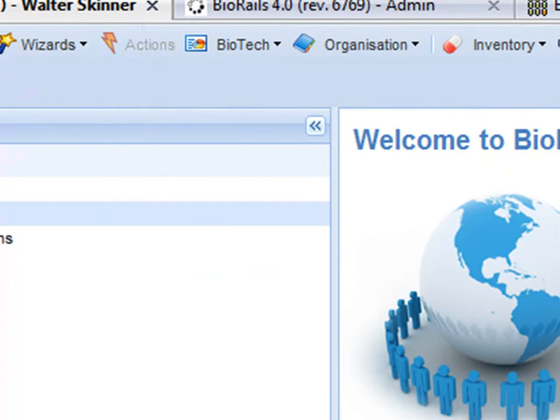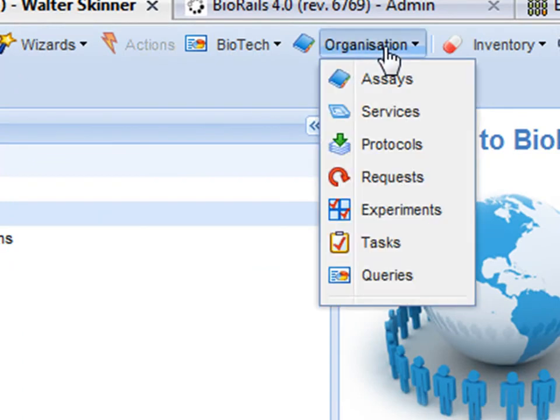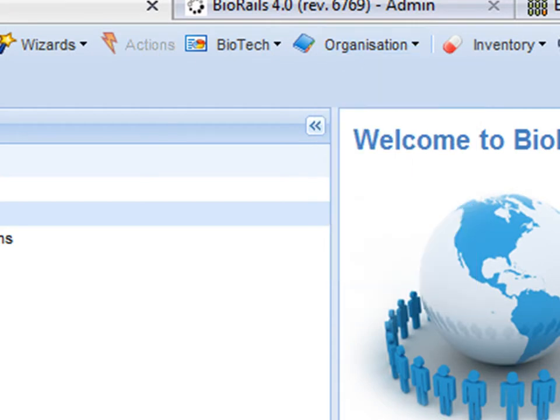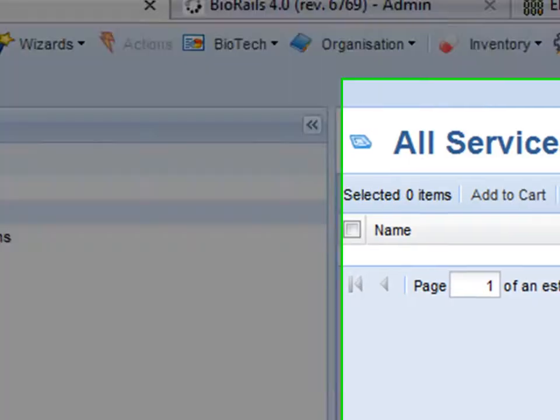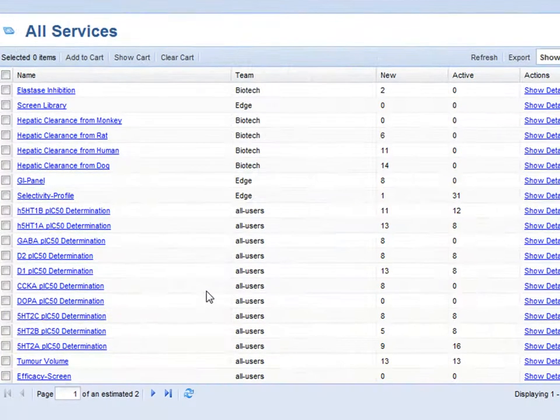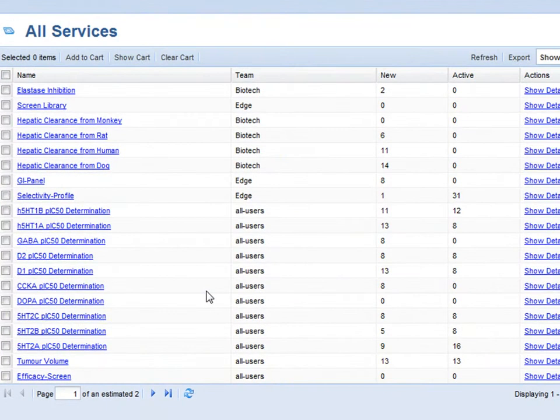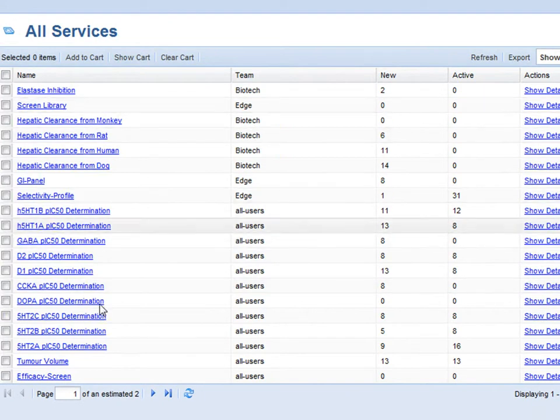Now I am going to take the position of the service provider. First I am going to look at a list of all the services that are available in the system.